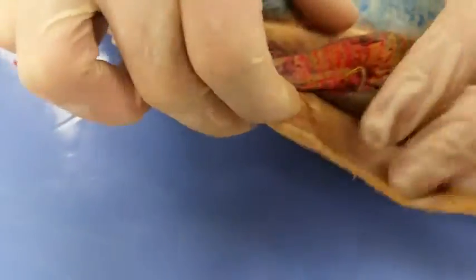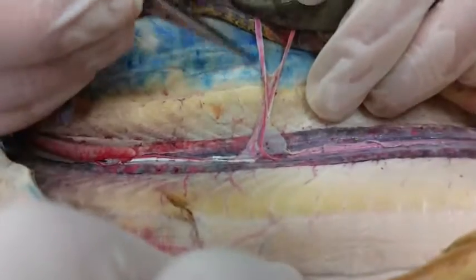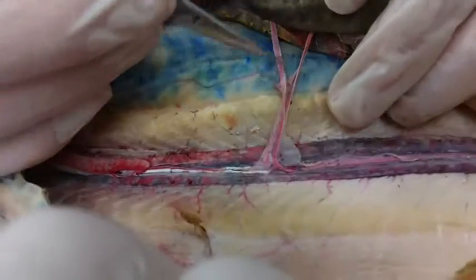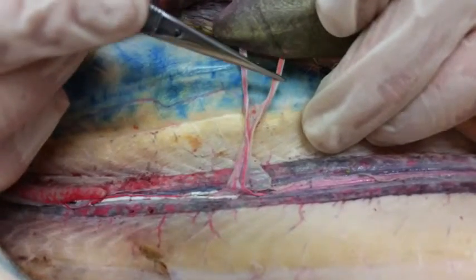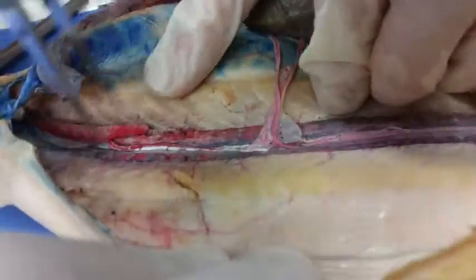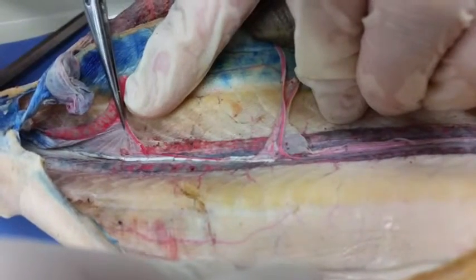When we get down here, we have these 2 large arteries. This one that starts first and finishes lower, so branches off first but finishes lower. That's the anterior mesenteric artery. And then branching off later but finishing more anteriorly, we have the gastrosplenic artery, again coming off of the dorsal aorta. On the rectal gland, we have that artery right there that's highly visible. That's the posterior mesenteric artery.